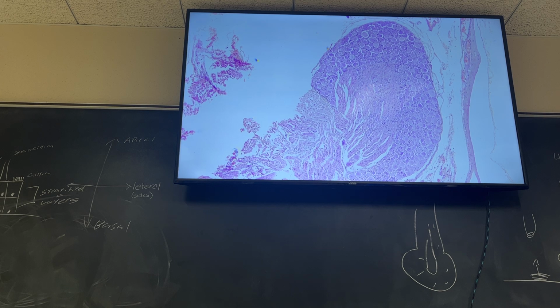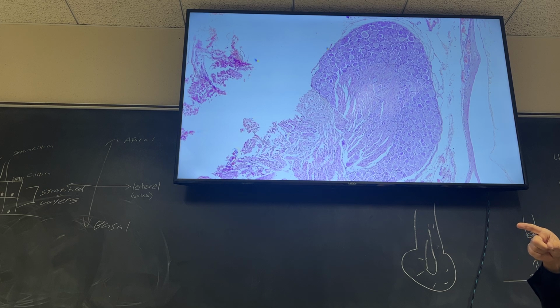And that's going to be this slide, by the way, this picture, right? Where it says B, dorsal root ganglia, right? So you're going to kind of have to look at both pictures. The gold one is showing how you can see the dorsal root ganglia on the sides of it, way off to the edges, right?